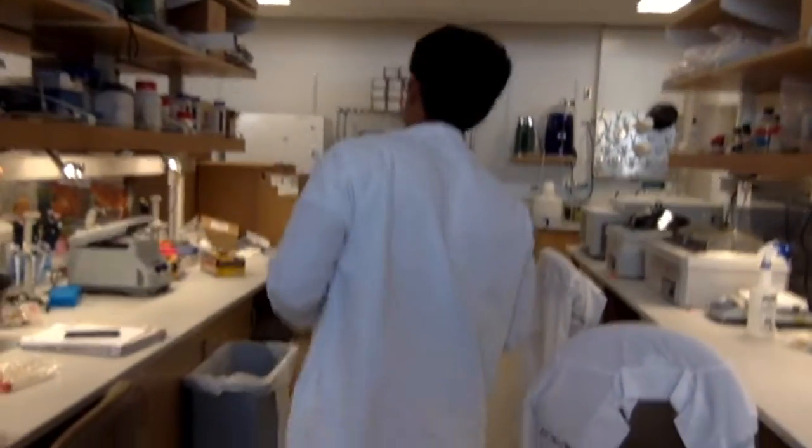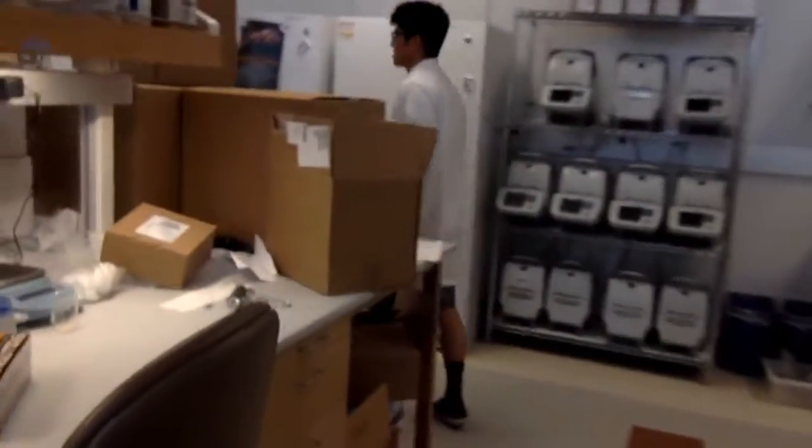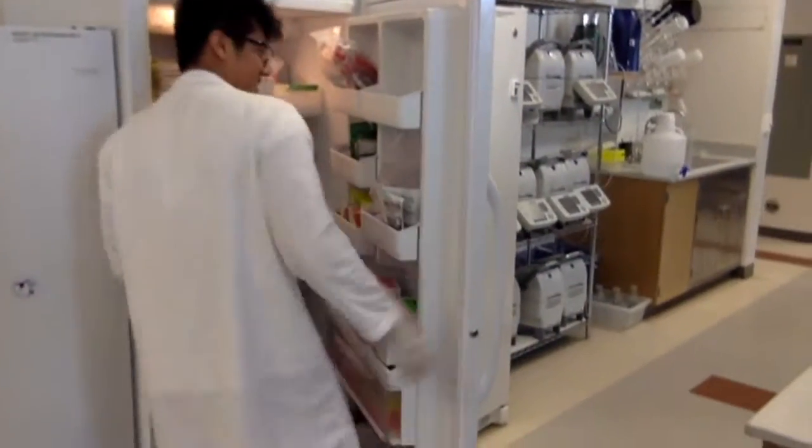Step 15: Finally, place your completed plate in the negative 20 freezer. Mission accomplished.